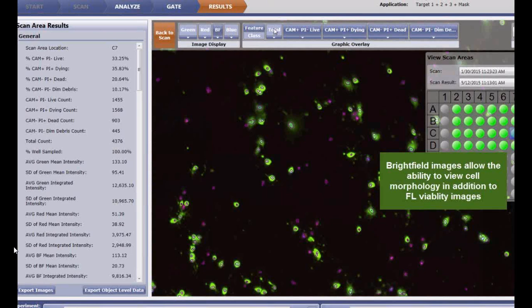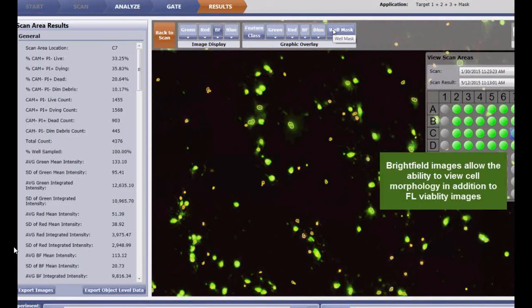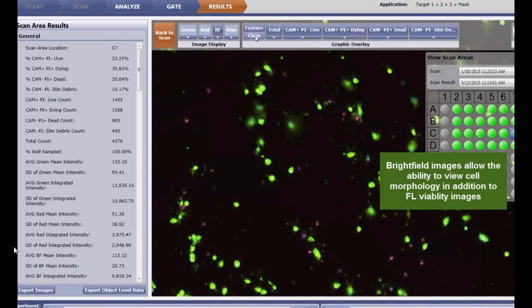And then turning on the classifications for our different classes, you can see how they're scored. And then the features is reflective of their mask, so it's really not that interesting.